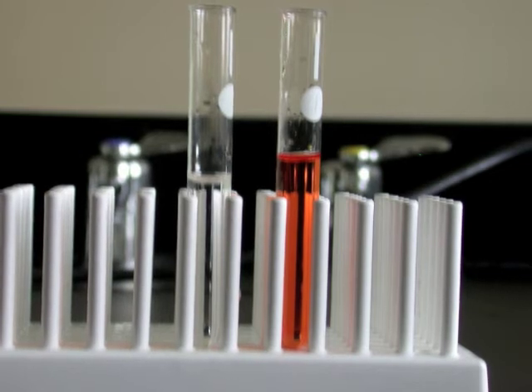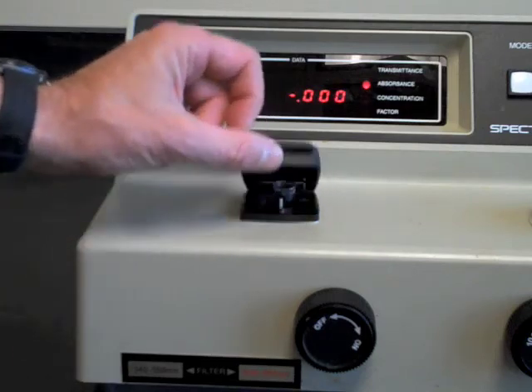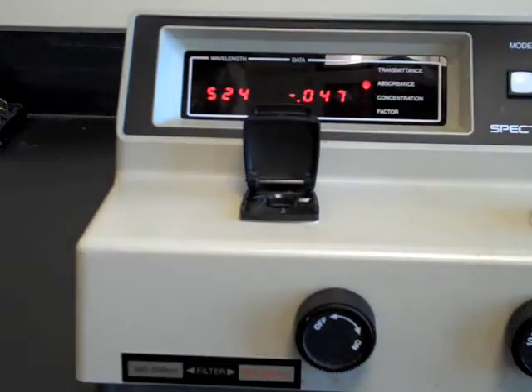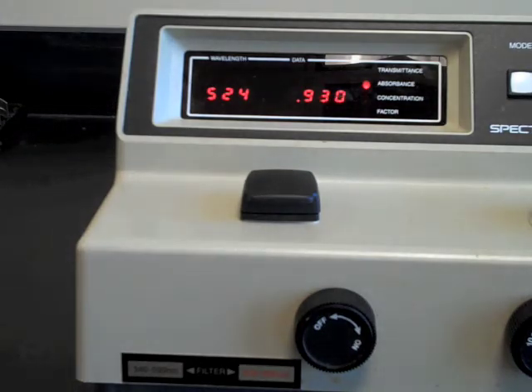The best practice is to keep one cuvette filled with a blank solution so that you can check that the instrument reads zero absorbance after the blank between each standard solution or sample that you test. That way, if the instrument drifts, you can go back and reset the zero absorbance value with the knob on the right.